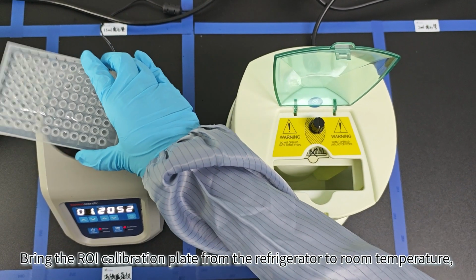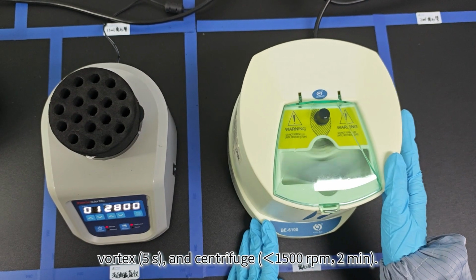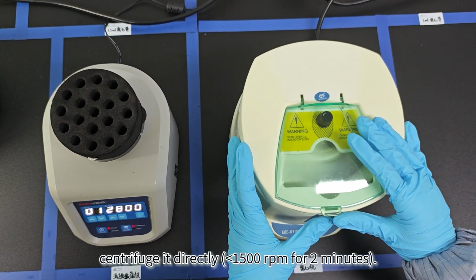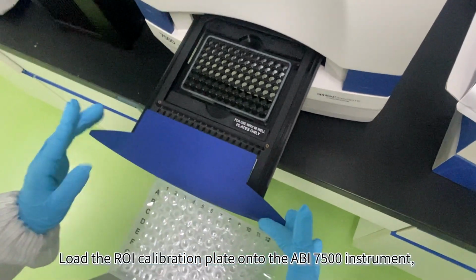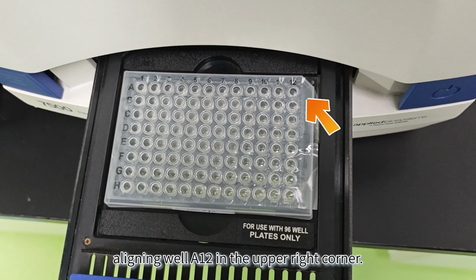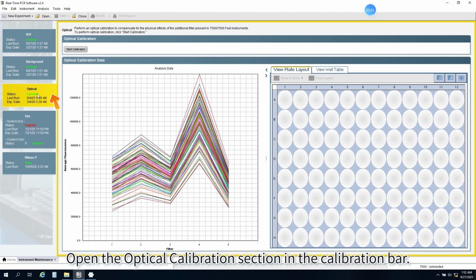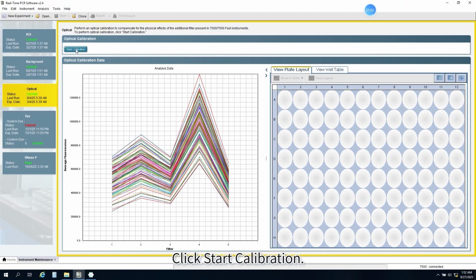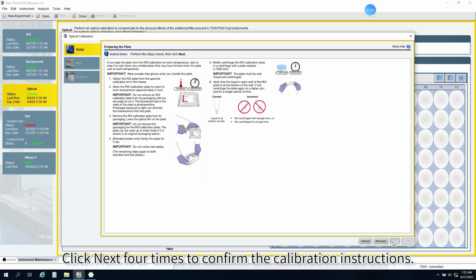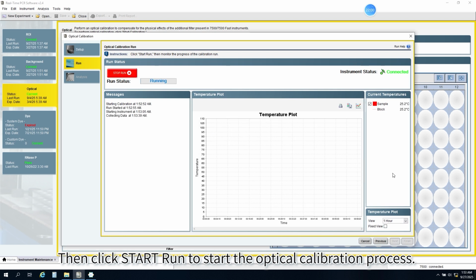Bring the ROI calibration plate from the refrigerator to room temperature, vortex, and centrifuge. If the ROI plate has been stored at room temperature, centrifuge it directly. Load the ROI calibration plate onto the ABI 7500 instrument, aligning well A12 in the upper right corner. Open the optical calibration section. Click Start Calibration. Click Next 4 times to confirm the calibration instructions. Then click Start Run to start the optical calibration process.